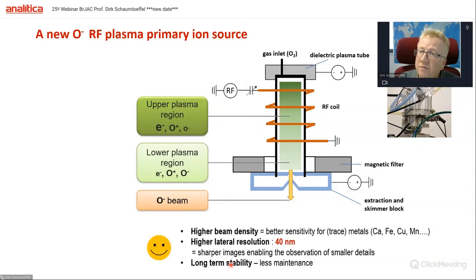In our laboratory, we were the first laboratory to have this ion source, or this kind of prototype of the ion source, worldwide. Now it's commercialized, and a lot of NanoSIMS labs are meanwhile also equipped with this new ion source.